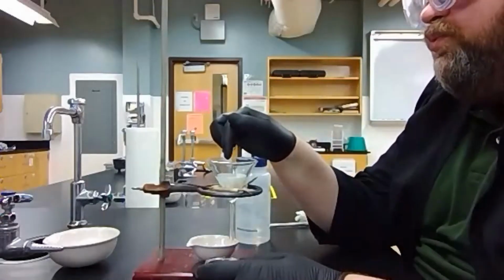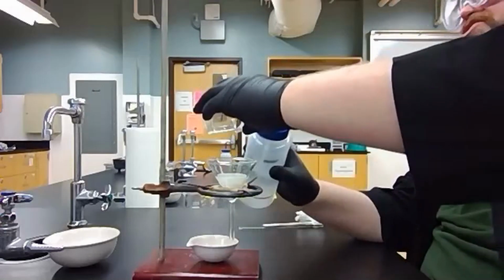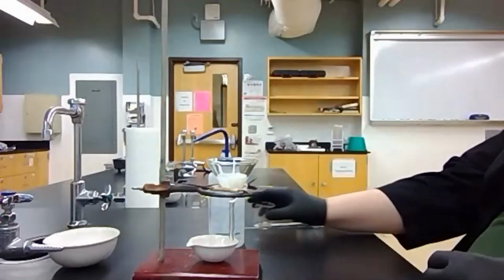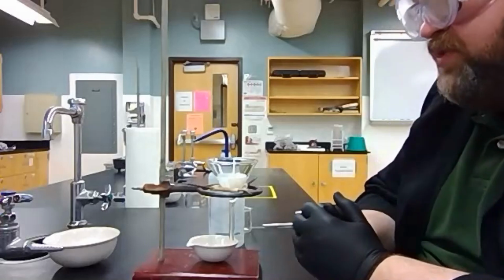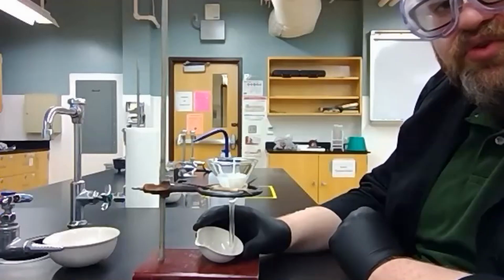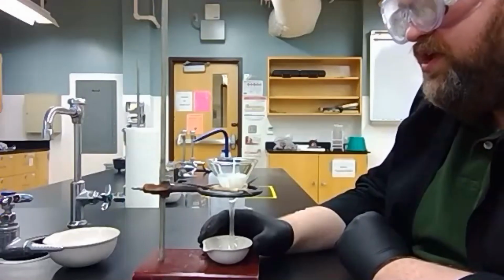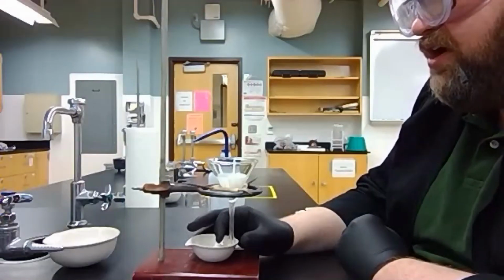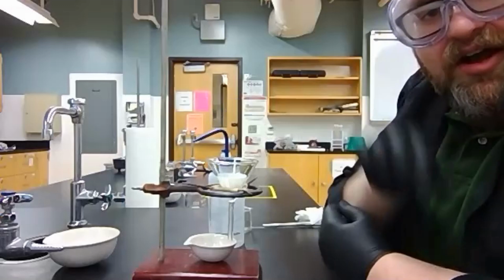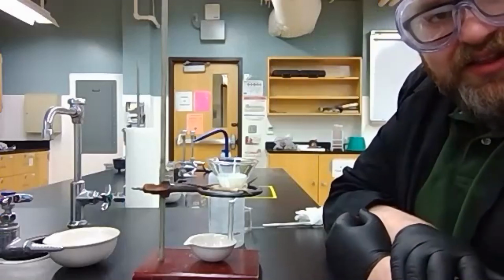Now, make sure that your liquid never goes above the height of your filter paper, and make sure that you give it one last thorough washing to get all of the residual salt that's on the side of the container out. Now, at this point, it's a waiting game. You'll notice that it's slow. This is gravity filtration. And while gravity feels strong to us, it's a little slow on everything else. So we're going to allow this to sit here and drain fully. We want to see no standing liquid on our filter paper up here. The filter paper will still be damp, but we don't want any standing liquid.